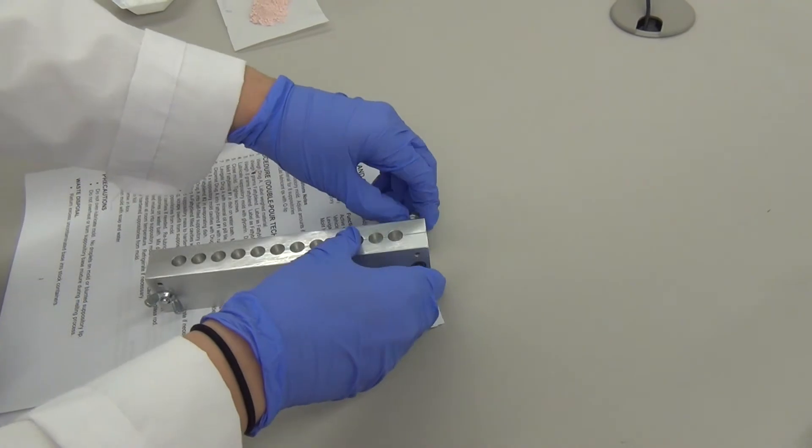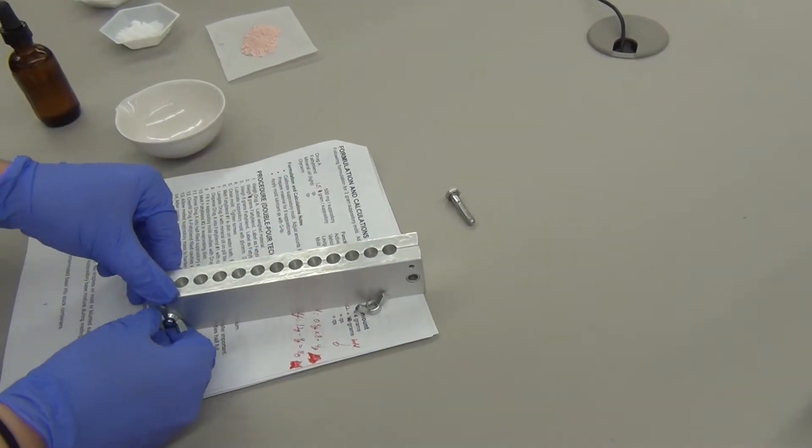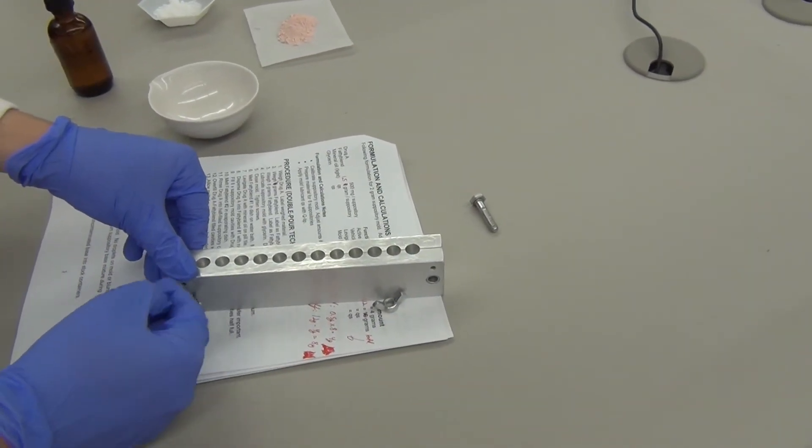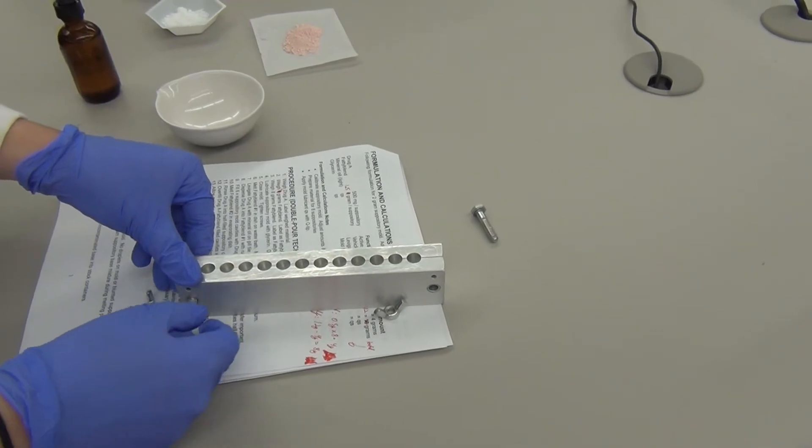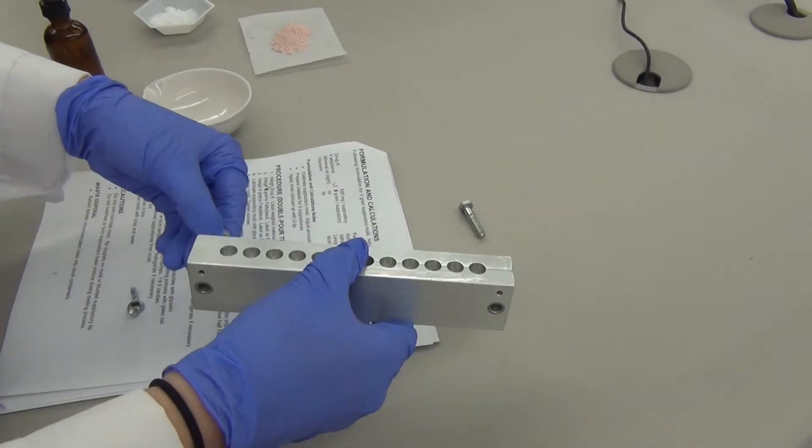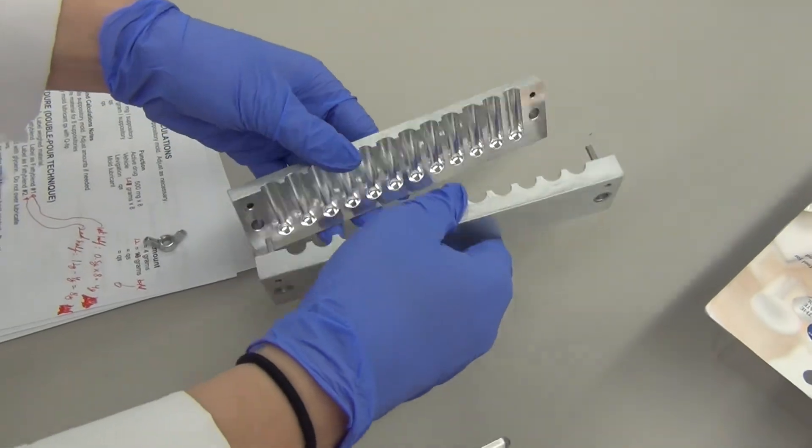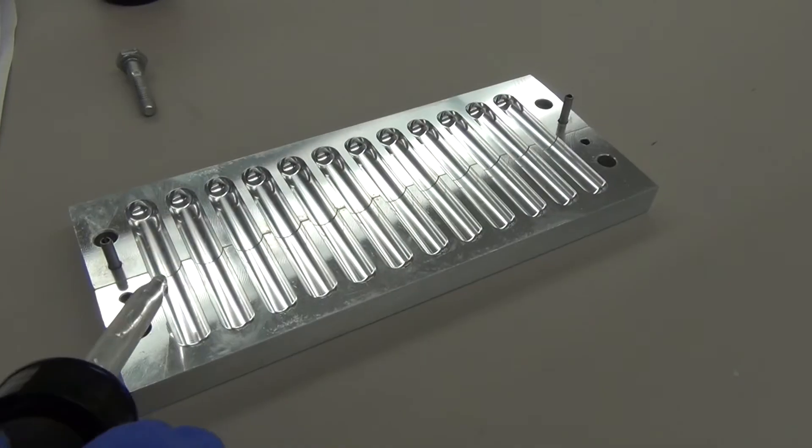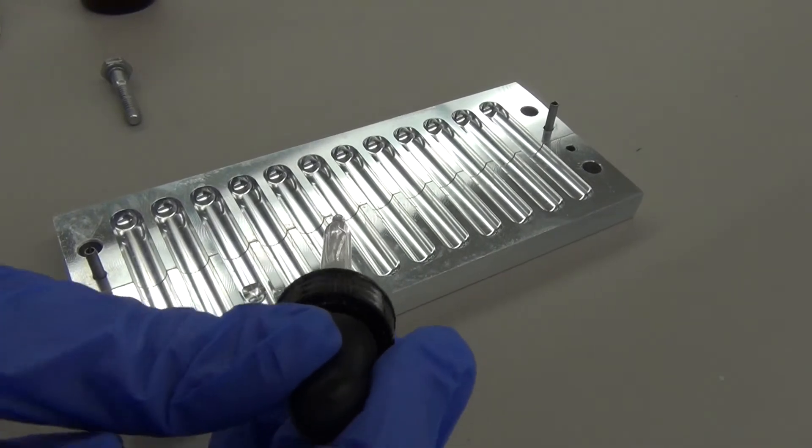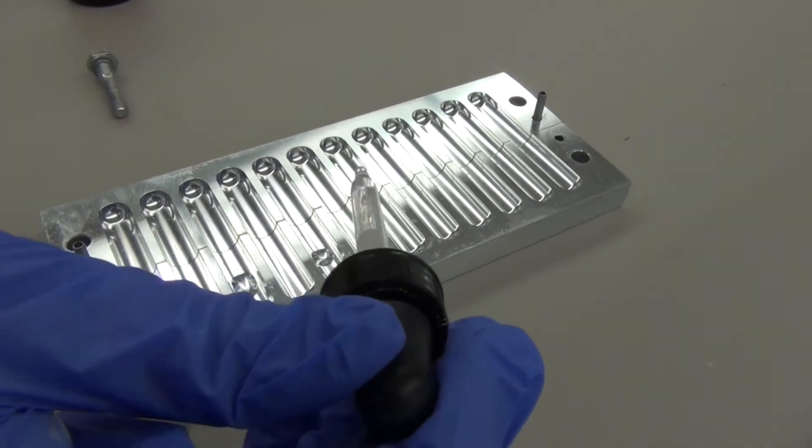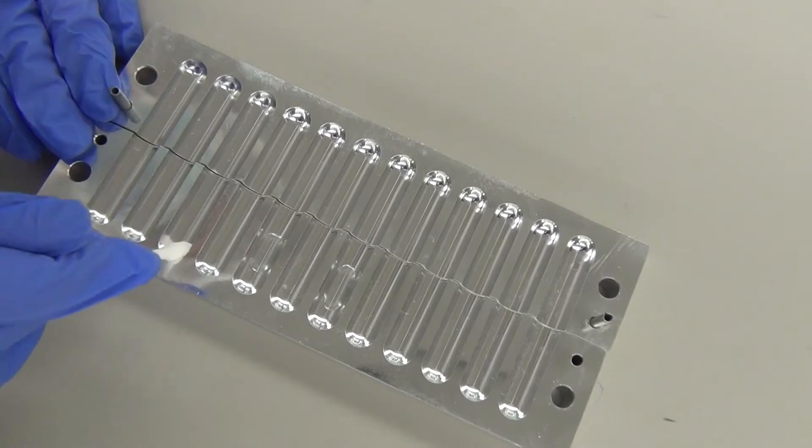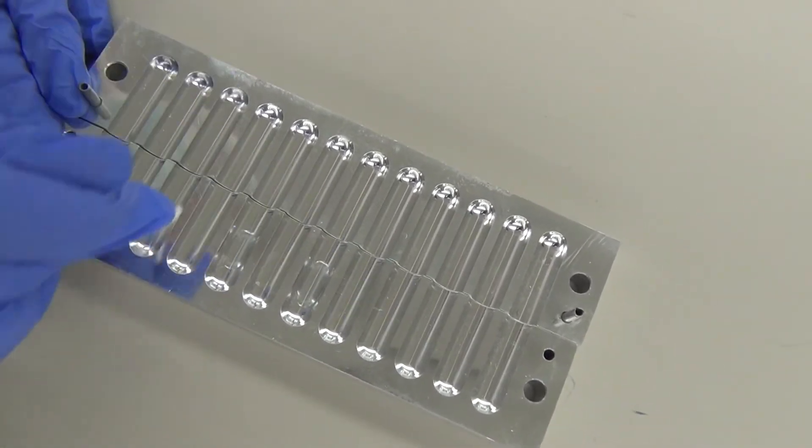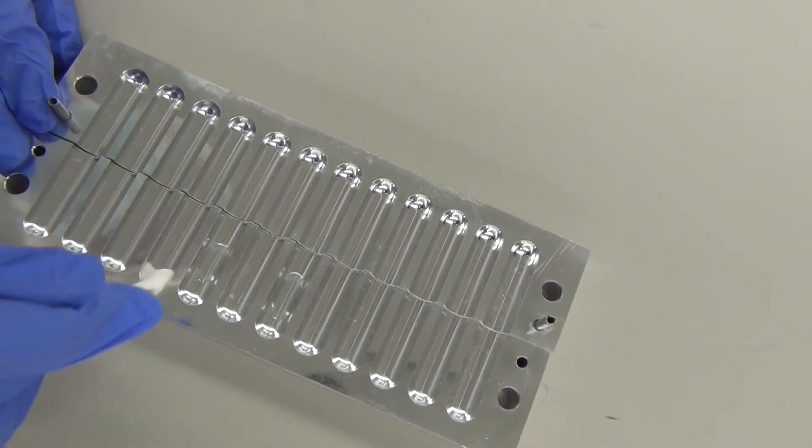In this case, the drug we are using is hydrophilic. So we would use fatty blend as our hydrophobic vehicle and we would use glycerin as our hydrophilic lubricant. Go ahead and open your suppository mold. Place one drop of glycerin into every other cavity.